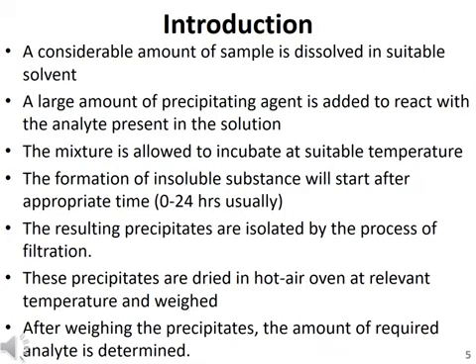After the reaction, some solid materials will be formed, which will be known as precipitates, and these insoluble precipitates will start forming after appropriate times. These times may vary from 0 minutes to 24 hours.